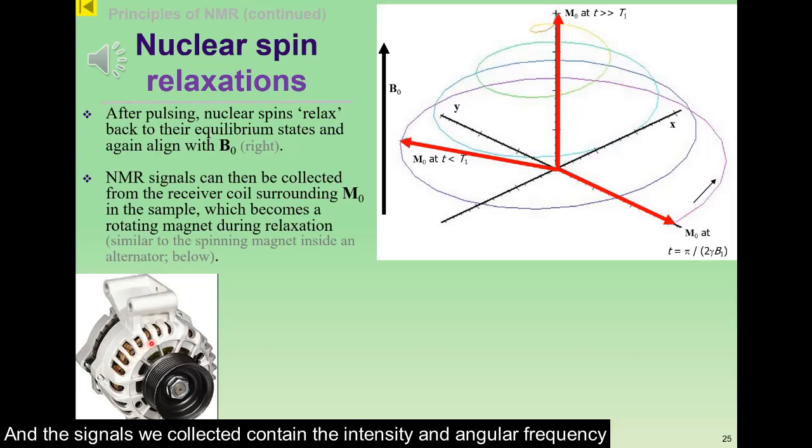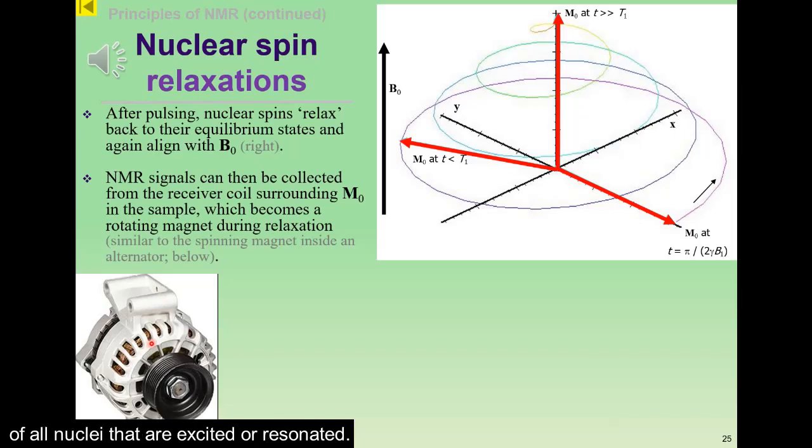And the signals we collected contain the intensities and angular frequencies of all nuclei that were excited or resonated.